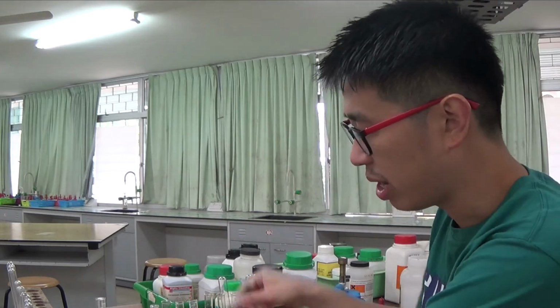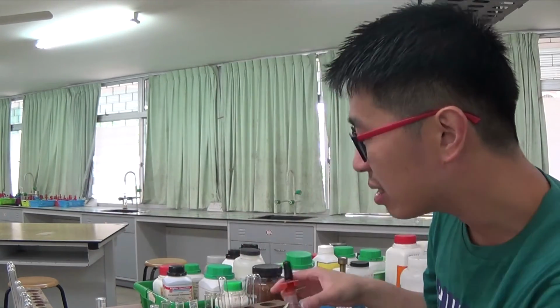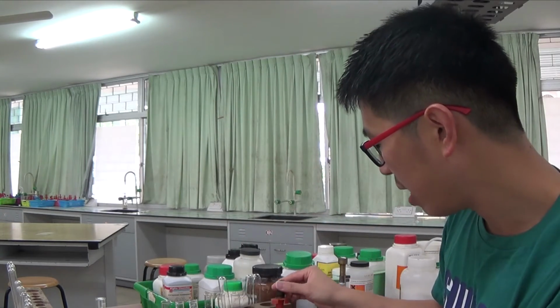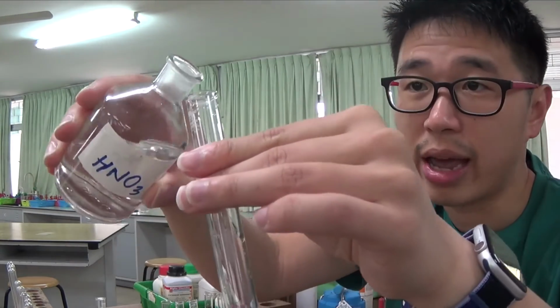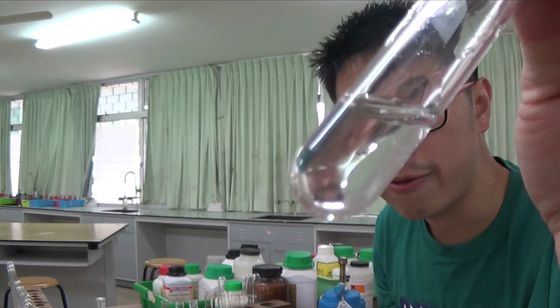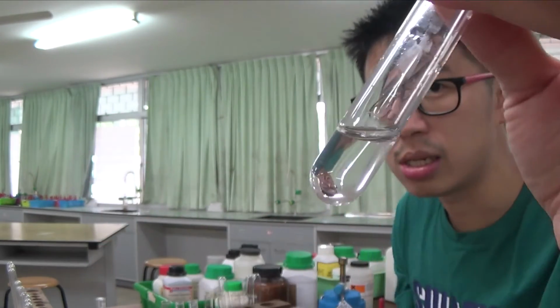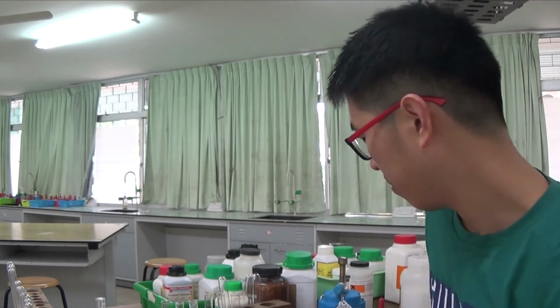So when you have acid, you can add dilute nitric acid, or dilute hydrochloric acid, or dilute sulfuric acid. Any acid, when you add it to anything that contains carbonate, it should effervesce. But there is no effervescence at all here. When I add nitric acid to this solution, there was no effervescence. It tells me that there is no carbonate. Okay.